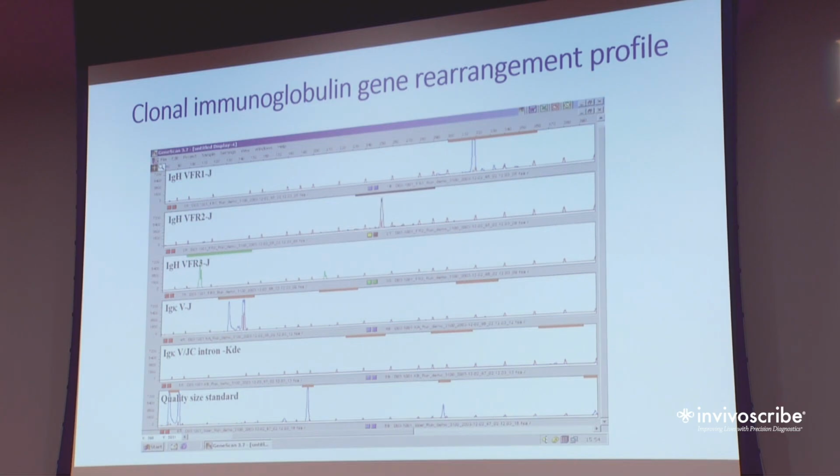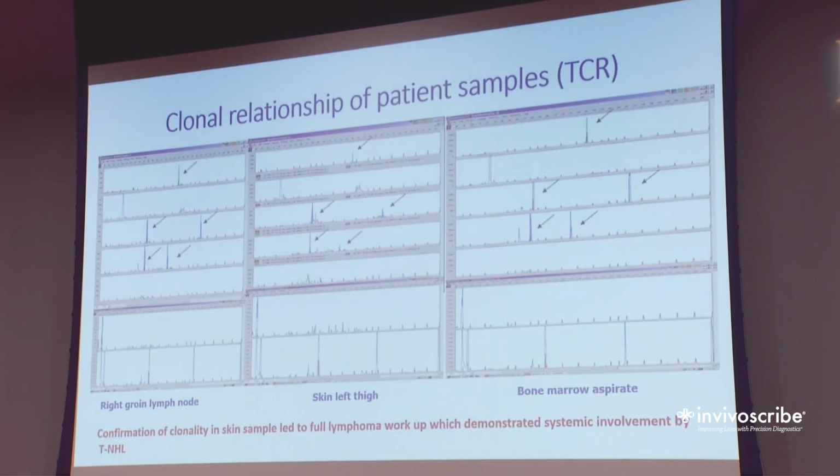Then your quality control size standard at the bottom shows how good your DNA actually is. Is it good to have 200, 300, 400? Obviously, it's best. If you've only got 200, you're not going to bring up some of those bigger markers. So what I say to people that have degraded DNA is to stay towards the smaller markers.